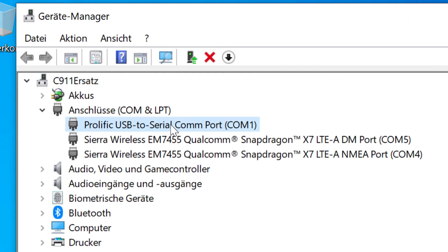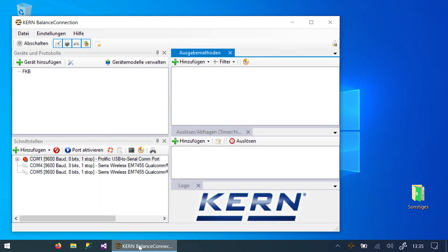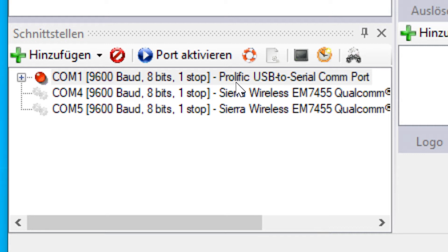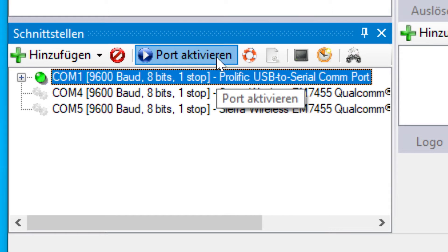Afterwards, the software for communication with the device can be started. A software called Kern Balance Connection is used in this video to communicate with the scale. The correct COM port has to be opened in the software.